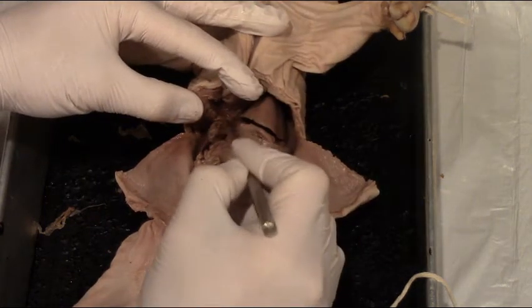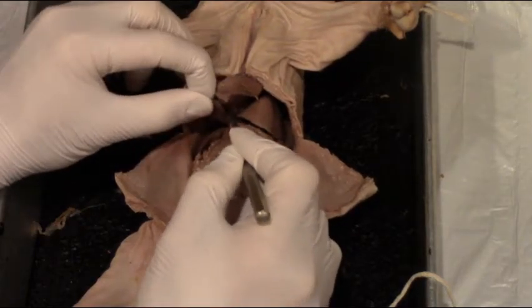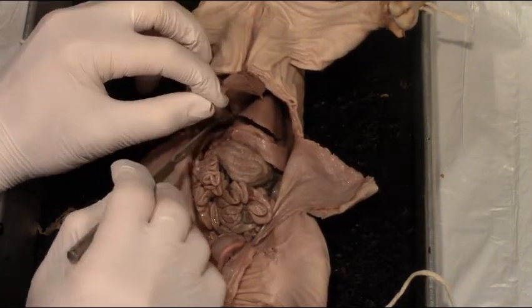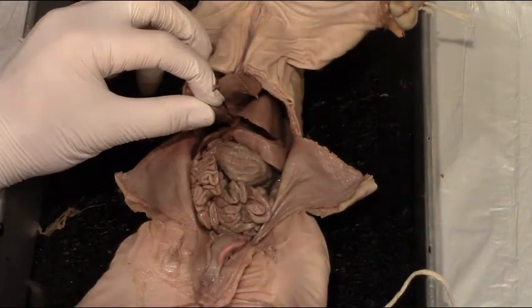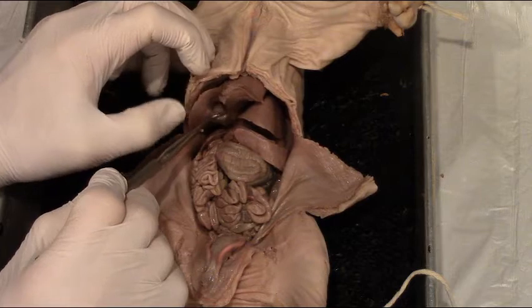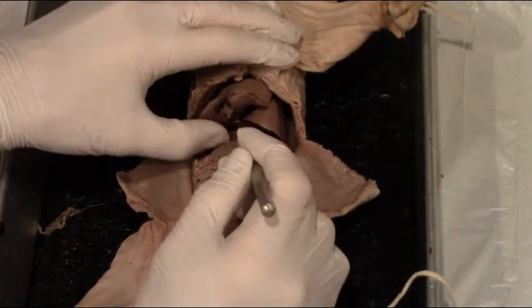The gallbladder is connected by a little cord called the bile duct, which is just a passageway. The gallbladder leads to the bile duct, and the bile duct is connected to the uppermost portion of the small intestine called the duodenum. The gallbladder is not directly connected to the liver — it's just pressed up in there, and that's its location.